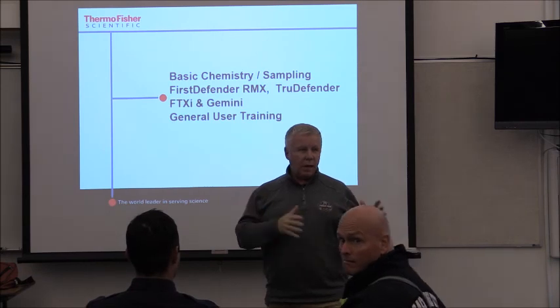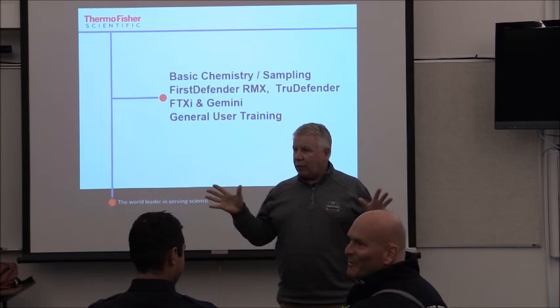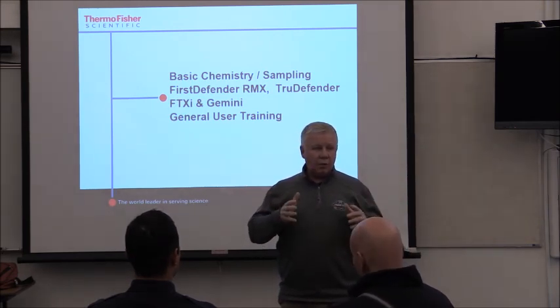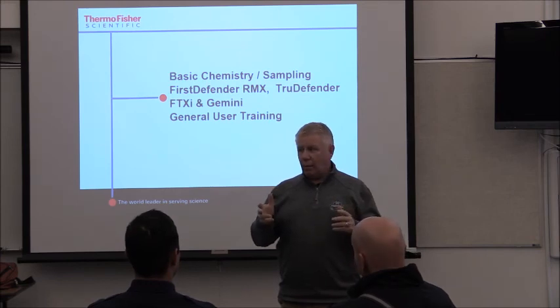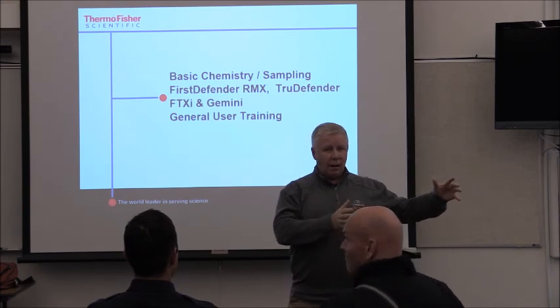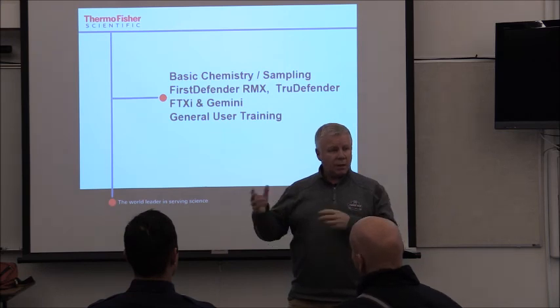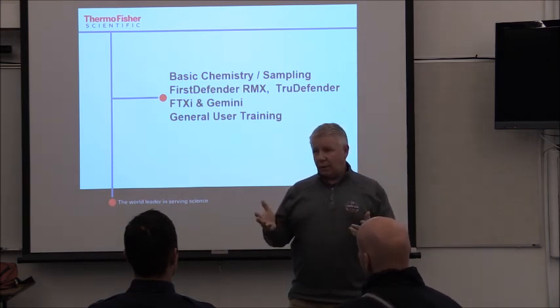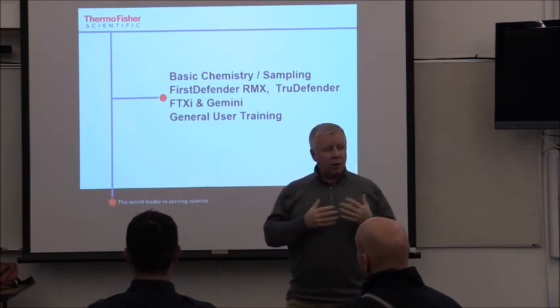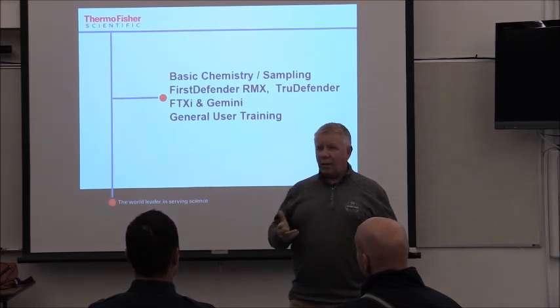when you talk about the two technologies, Raman versus the FT technology, they see different things, they see in a different manner. An easy way to describe it is if we're going to do biometrics on everybody in the room, let's say this half of the room I do a retinal scan, and this half I do a fingerprint. I'm doing the same basic thing ultimately to identify a person, but the technology and the way I go about doing it is different. So because of that, there is a little bit of a difference in the capabilities. There are things that one of the devices sees that the other doesn't, and vice versa. So you want to keep that in mind.